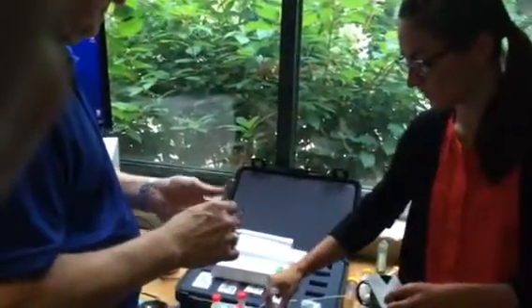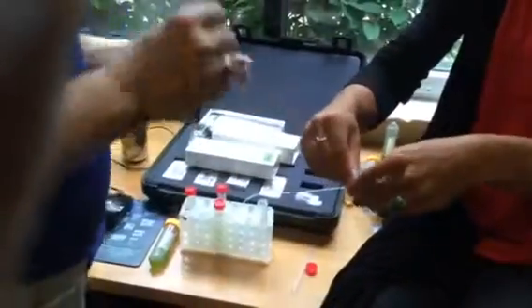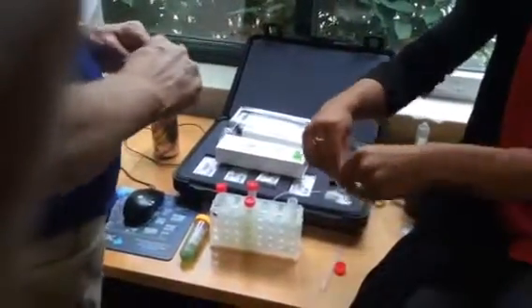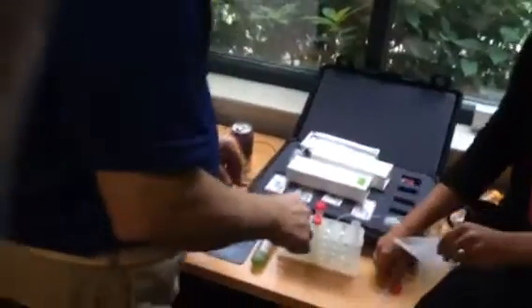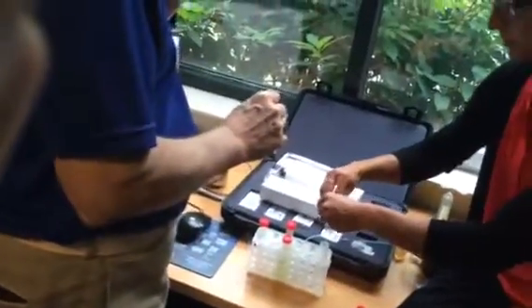In real life, we might date it or put the same ID number that we're going to put in the run summary. So we've got this mesh that we took and turned to make the funnel. This is what I want, so we'll take this.